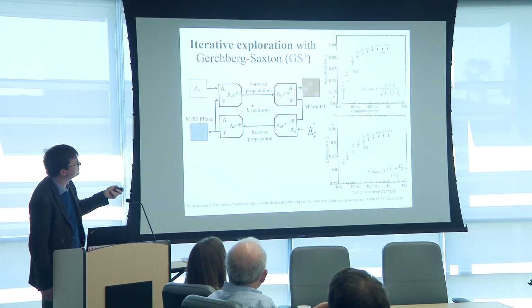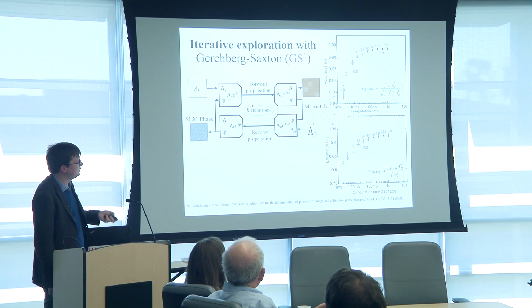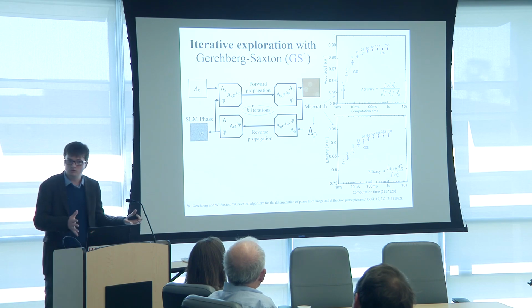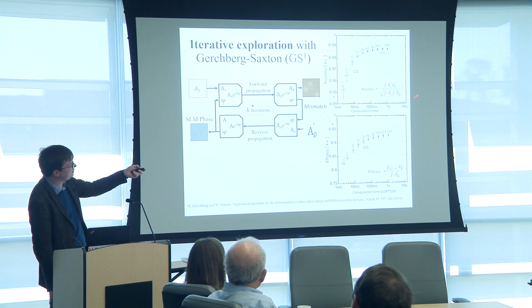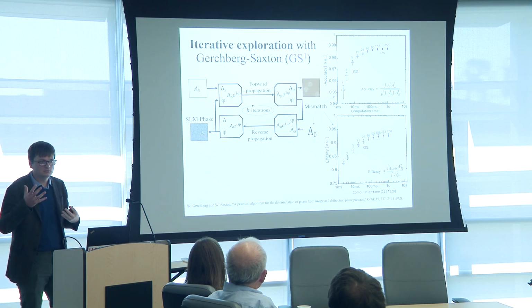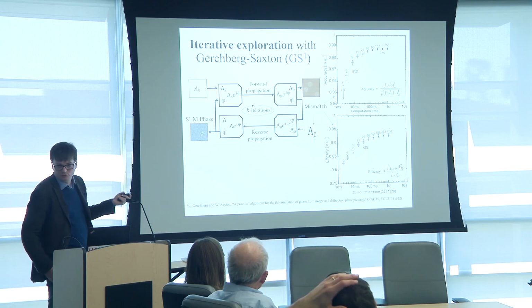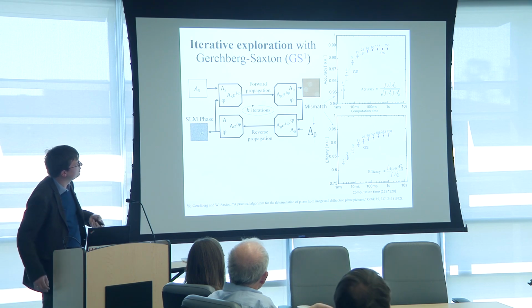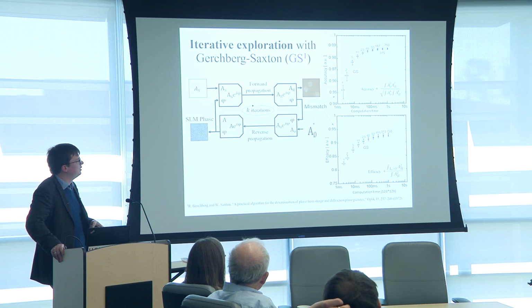And what you can see from these two graphs, so this is a sample that we're computing in order to really display what's happening. You can measure the difference between the hologram you get and the hologram you want. And you can use multiple metrics. For instance, we use two that are common. The accuracy is the L2 norm. It basically measures the match of distributions, intensity normalized, between 0 and 1. 1 would be like identical holograms, and 0 would be actually, I don't even think you can go to 0. Basically, it goes towards 1 as an indicator of the match of your hologram.